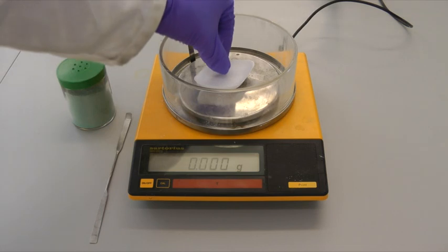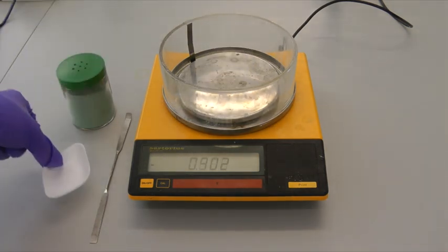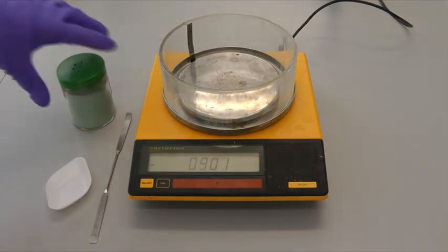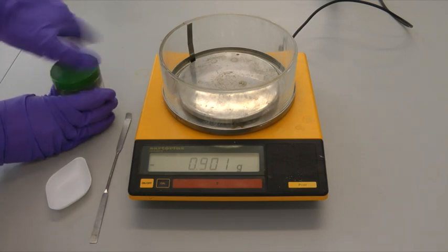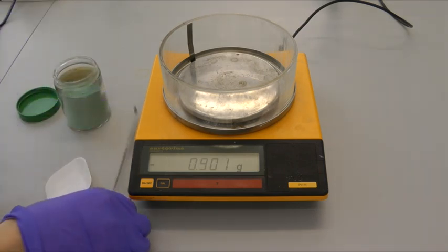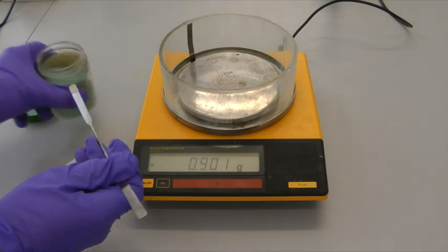The weighing boat can then be removed from the balance and the material to be weighed can then be carefully transferred using a spatula. Take care to avoid spillages.